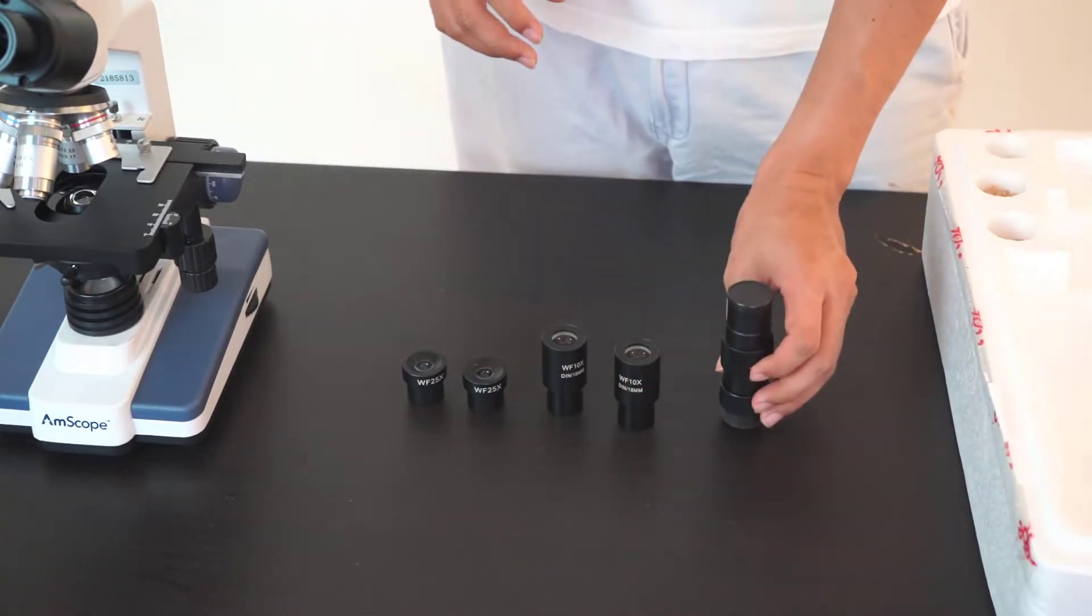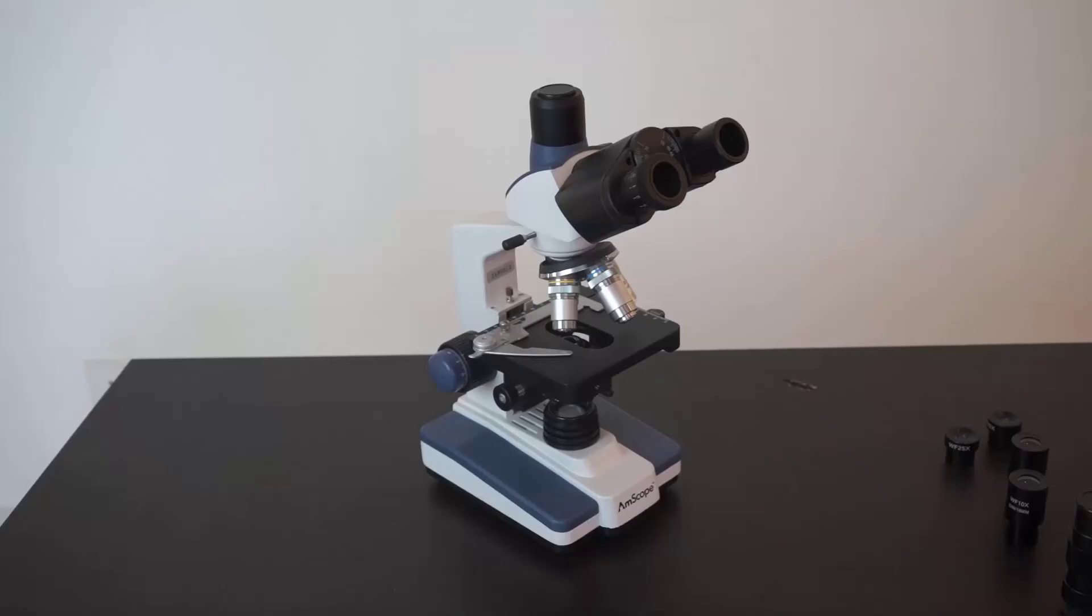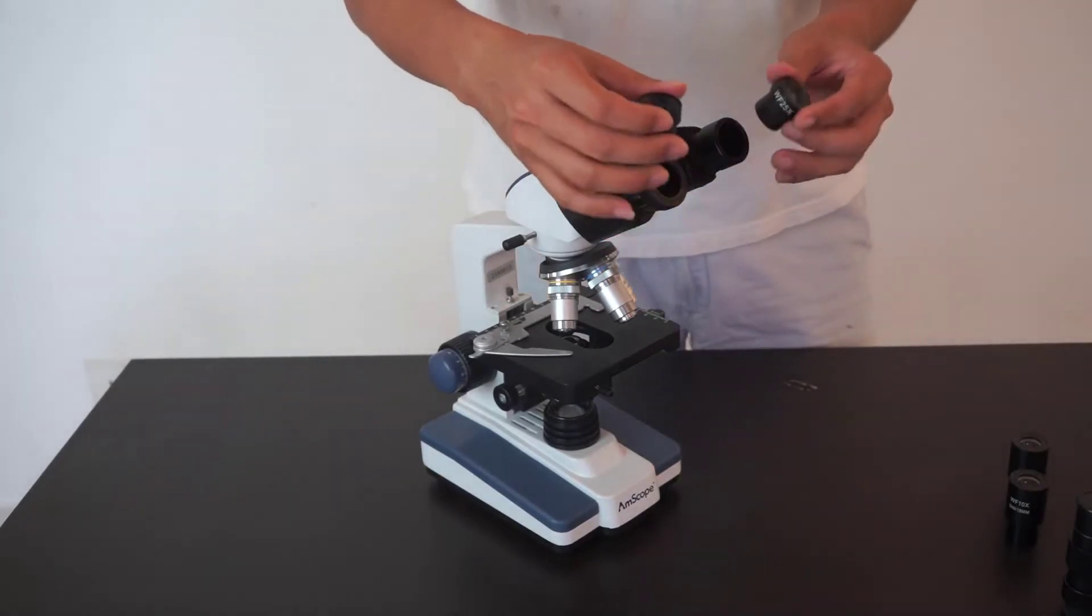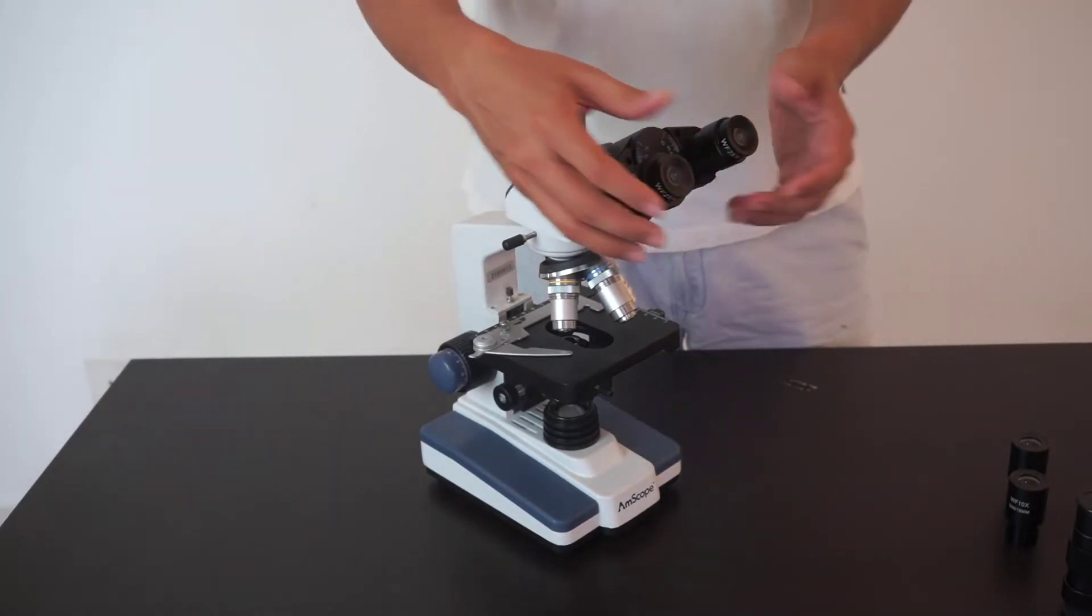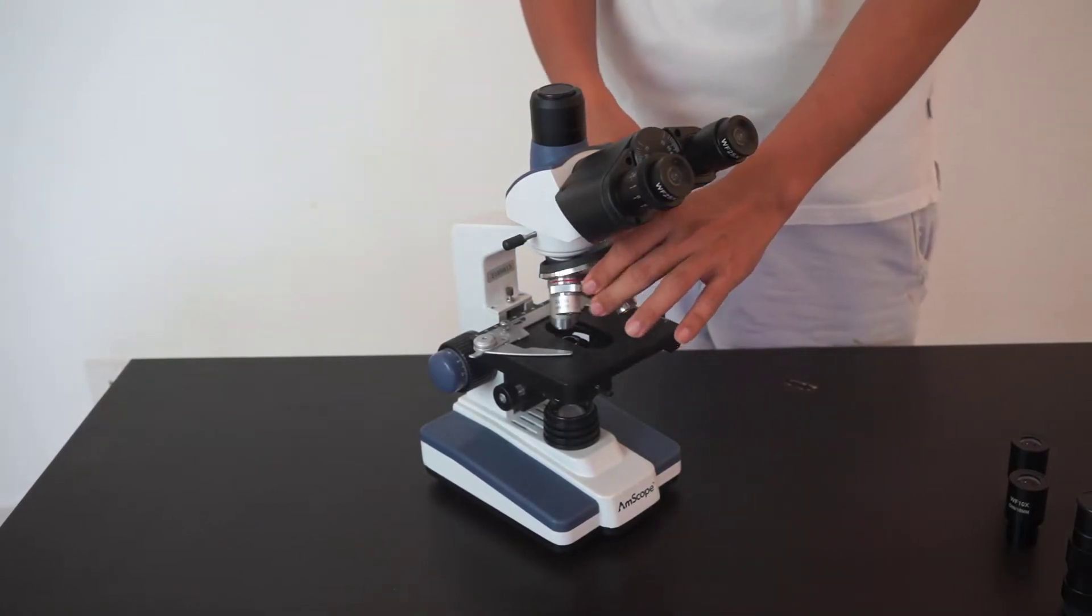There's a trinocular port and dust cover. To use the microscope, we will first need to insert the eyepiece into the microscope. To get the magnification that we want, we just turn the turret of the microscope.